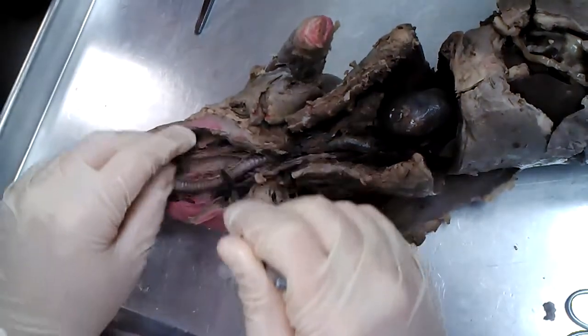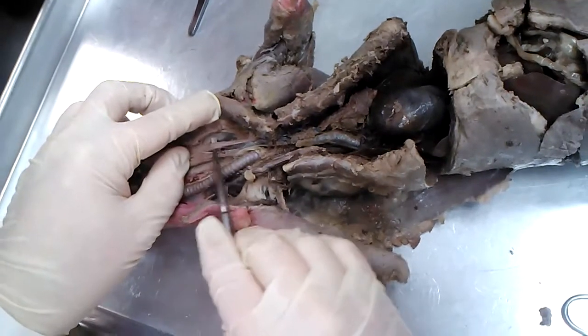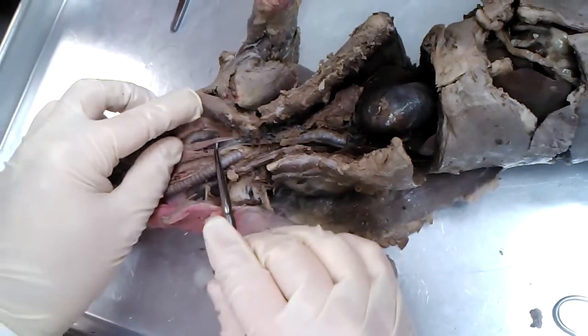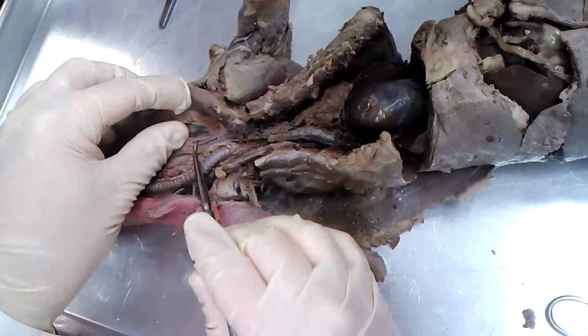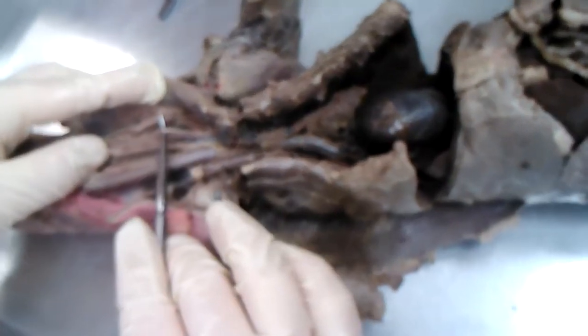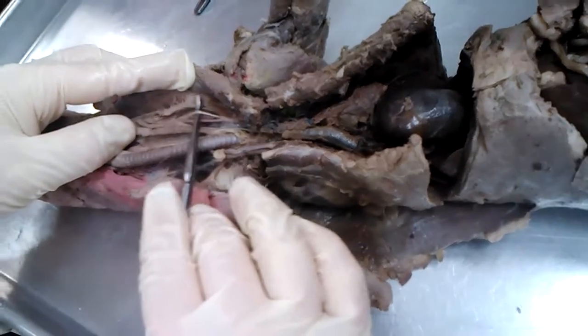Now on either side of where the trachea and the pharynx were, we also had some blood vessels, an artery, a vein, and a nerve, a neurovascular bundle. Most minks, the artery and the nerve showed up well, the vein did not. The nerve right in here, you can see, is the vagus nerve. What will this be, by the way, left or right? Left. So left vagus nerve.